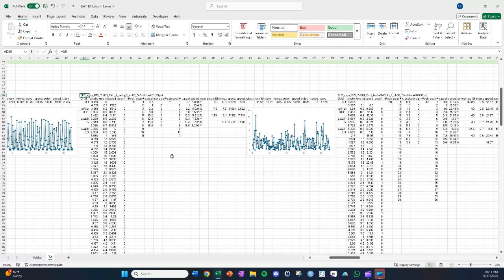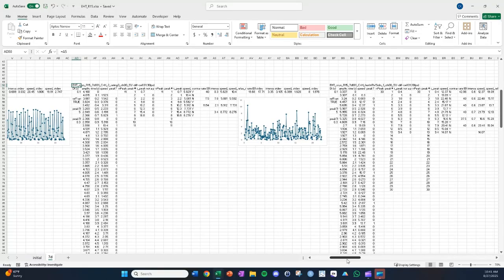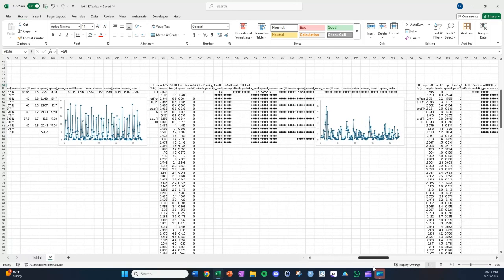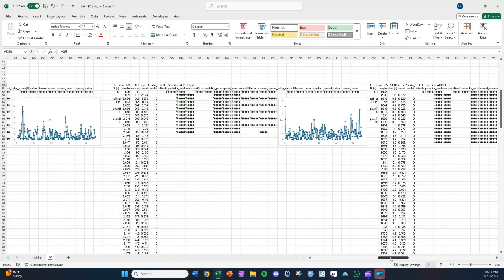This is going to be harder to analyze, somewhat expected since I already noted the beating was worse. And in case you're curious, it could get worse than this. This is a rating of 3 of 4, and you're still seeing some peaks that are rather significant, above 2 or 3. In fact, a lot of these are above 2 or 3 arbitrary units per second. But if I can find one here with an even lower rating, these are both low ratings.